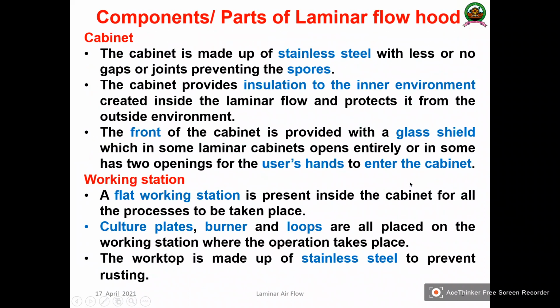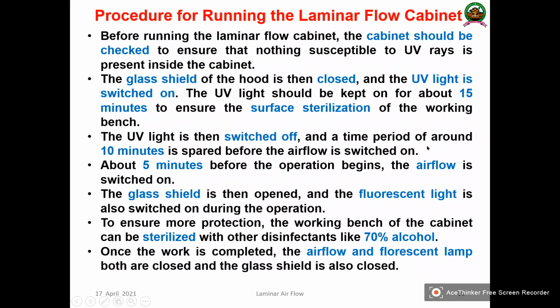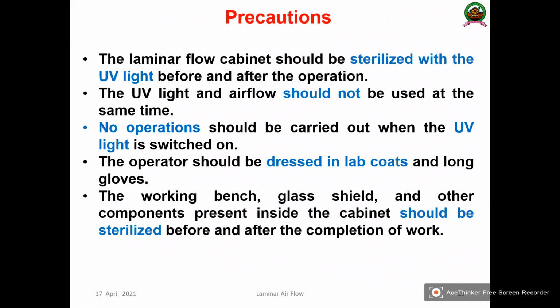Whenever you work with the laminar airflow, you should wear your apron, the lab coat, and the hand gloves also. Instead of this you can wear a head cover also. So that is another important precaution. Then the working bench, glass shield and other components present inside the cabinet should be sterilized before and after the completion of the work. And this is one of the important aspects where you need to study.